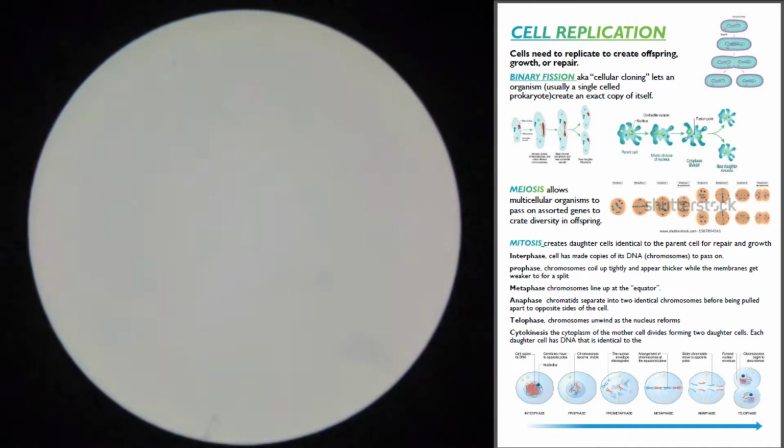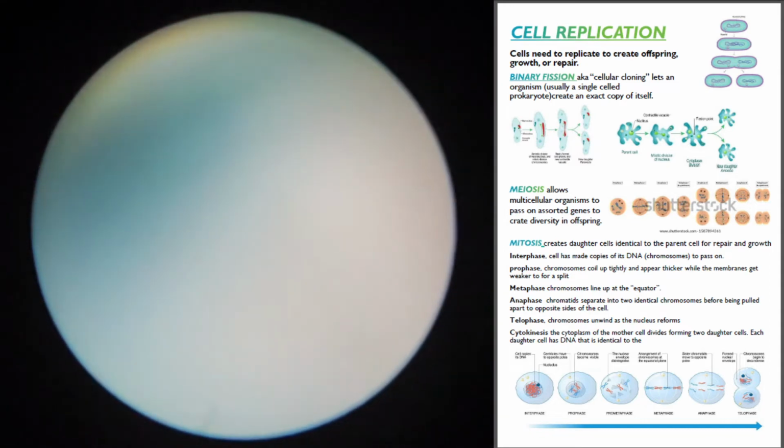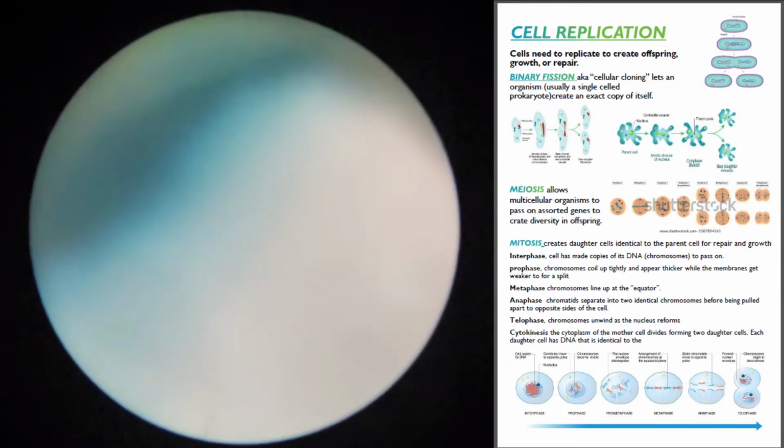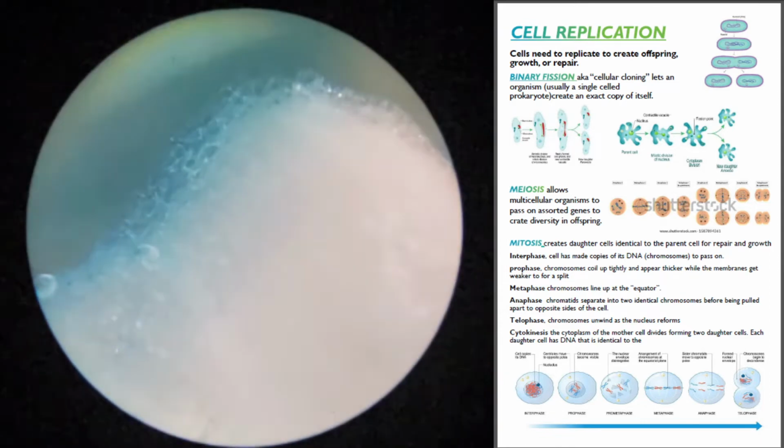Fine tune. Uh-oh. Oh no. Did I lose it? Okay, I'm going to go back to the scanning. Let me find it again. There it is. I like what I see.